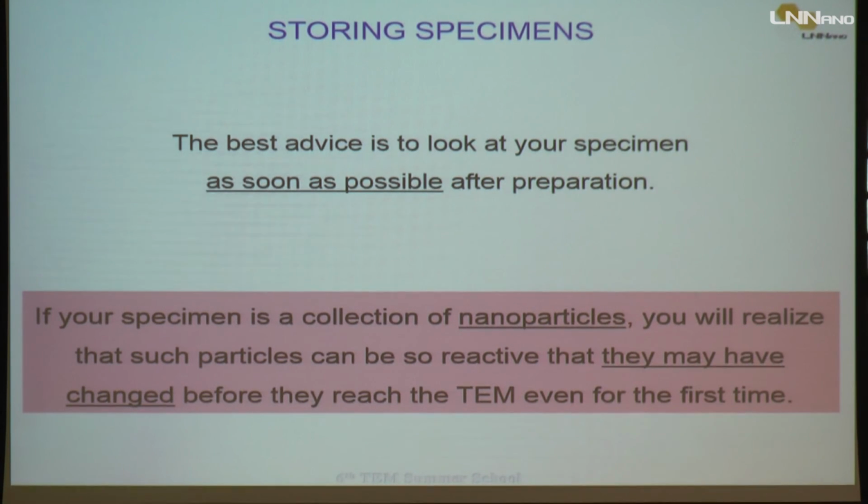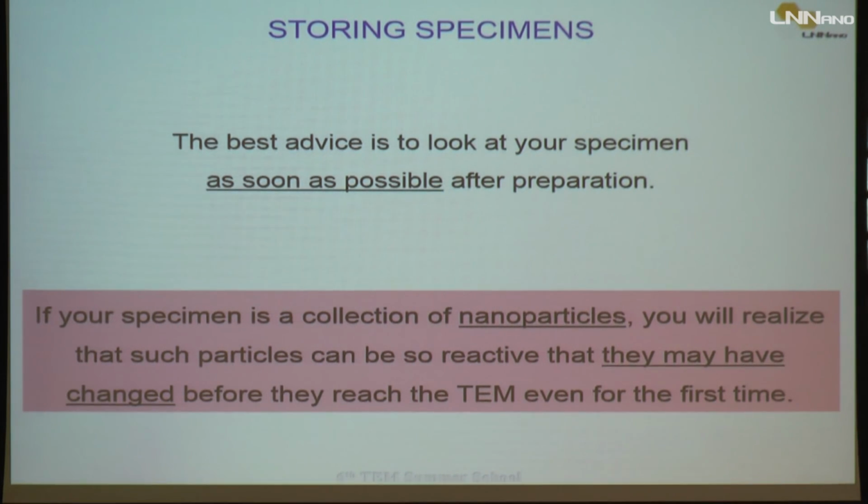Here I will talk very quickly about the storage of specimens. It's very common to have a sample that I prepared last year and it is inside my pocket and so on. It's not good, because when you prepare materials in nanometric dimensions, the forces, the chemical reactivity and so on, are very different from bulk materials.